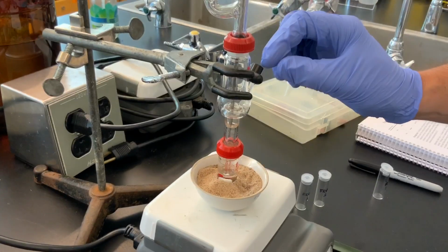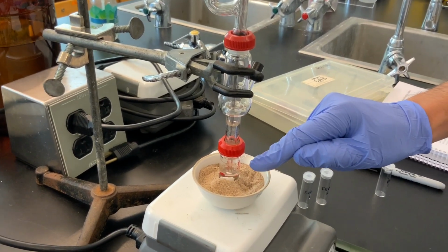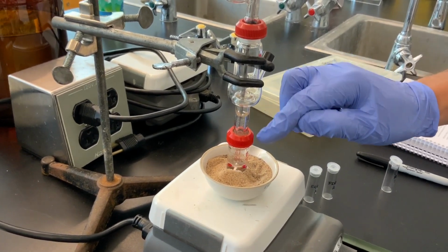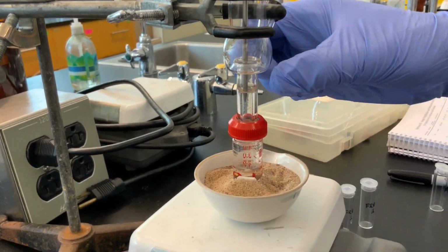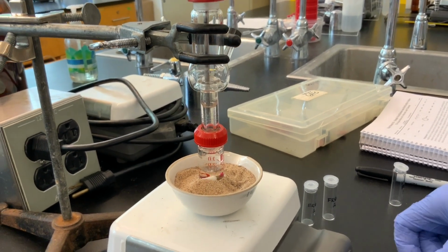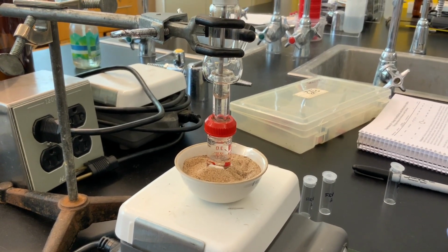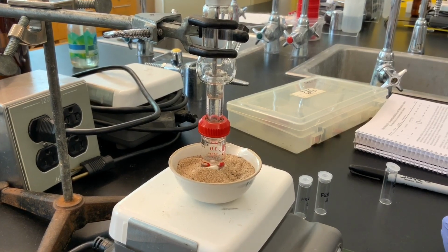And so we're going to collect distillate out of here. We're going to be able to see that once the hexane starts boiling, we'll see it start to vaporize, condense down, back and forth, back and forth, until the glassware is the same temperature as the boiling point of hexane, and then we'll be able to start collecting our first fraction. We're going to collect all fractions with Pasteur pipettes, and we're going to use 3 different ones, of course, to try and minimize contamination.